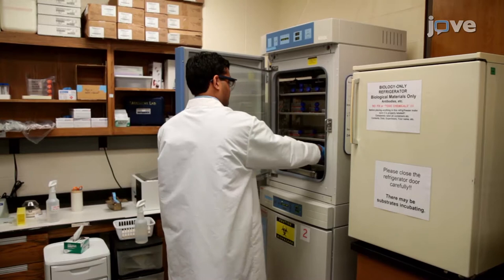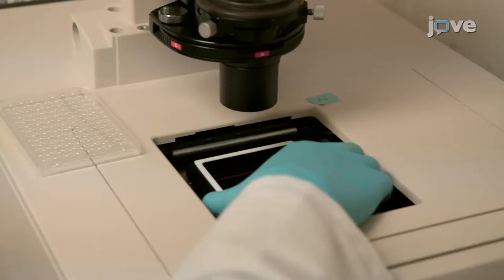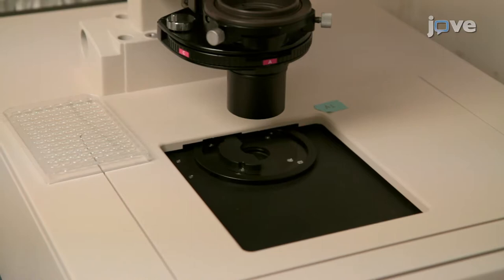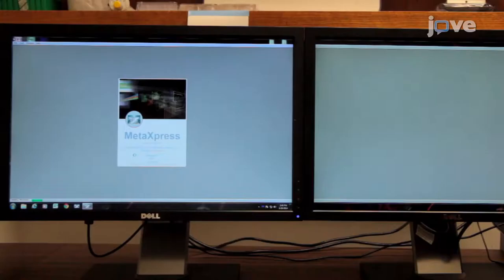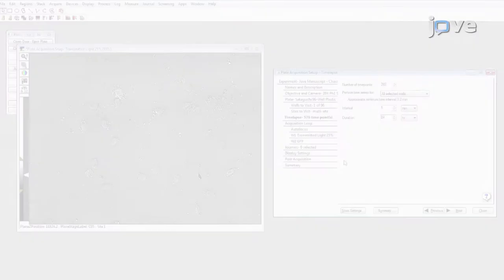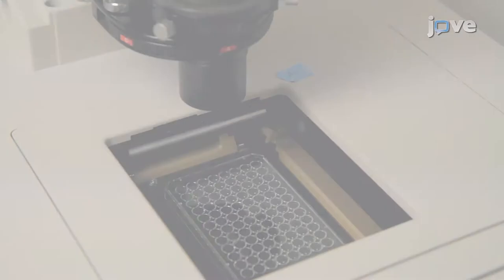Next, after the 2-hour incubation period, remove the 96-well plate from the incubator and place it directly into the environmental chamber of the HCS system. After allowing the plate to equilibrate for 30 minutes, start the software to configure the plate settings. Once the imaging parameters have been set up according to the text protocol, use laser autofocus to focus on the well bottom and take test images from multiple sites and multiple wells to find an optimized focal plane. Once the focus has been established, begin capturing images every 5 minutes for 48 hours for all 60 wells.